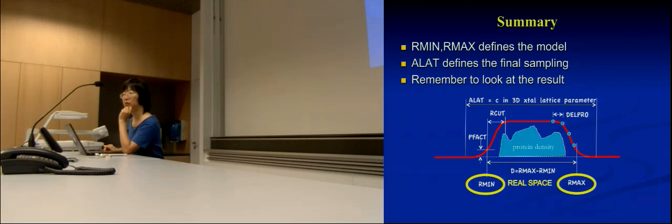Actually, I'm not clear. If you merge in P1, but your symmetry is really P6, do you need to remerge again? And would that higher symmetry help your lattice line fitting because there'd be more spots? Yes. So you do need to remerge, because if you merge in P1, you're not going to be at the right origin. Every symmetry, the origin is usually defined at the point where it's the highest symmetry.